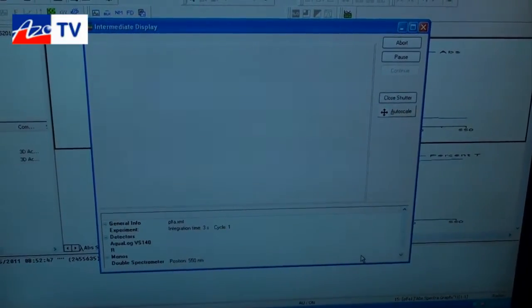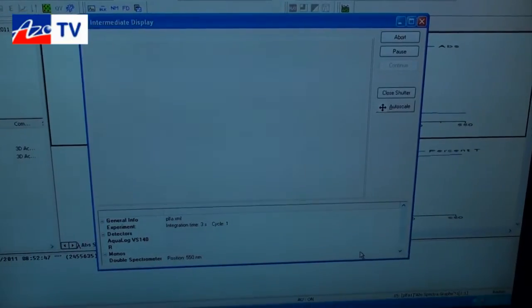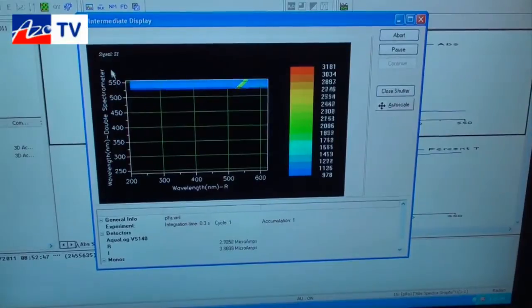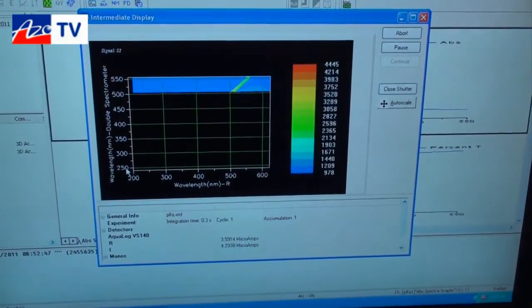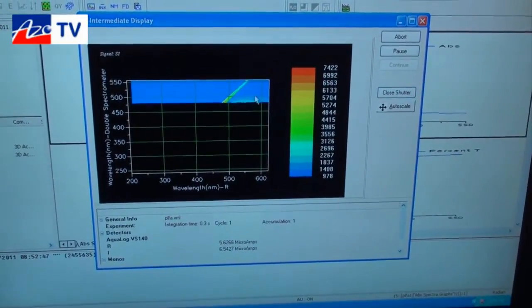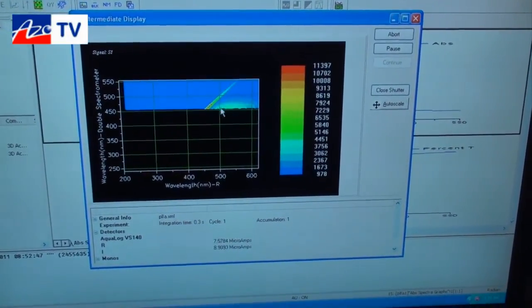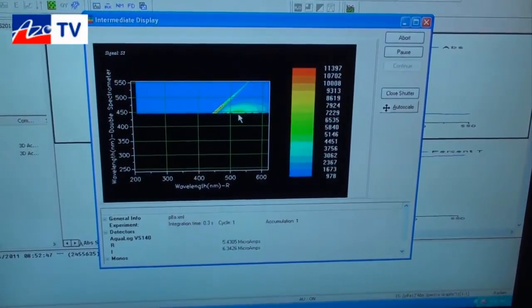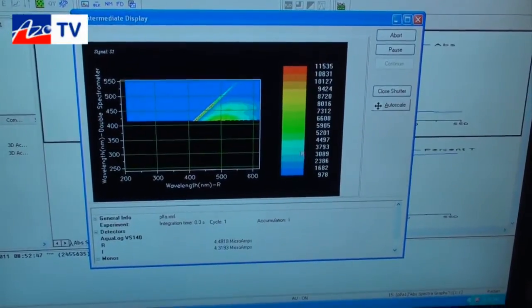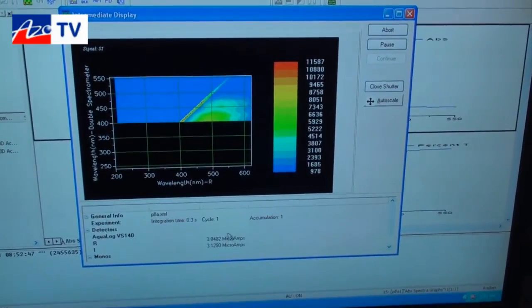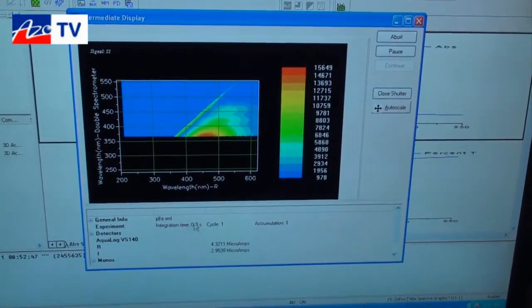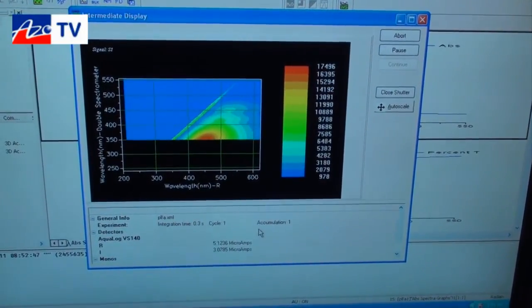So this is a picture of the data as it's being collected. You'll notice we're scanning the excitation axis in reverse again to minimize photo bleaching, and on this side we have the emission axis which allows us to visualize the fluorescent compounds that are in the standard sample. This intermediate display gives you an ongoing view of how the instrument is performing, the position of all monochrometers, spectrographs, and signal intensities as the data is being collected.